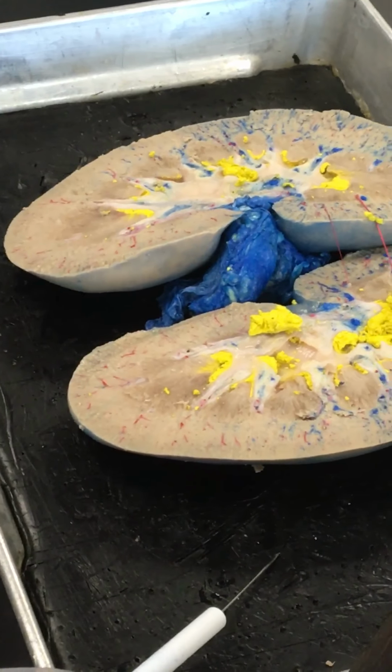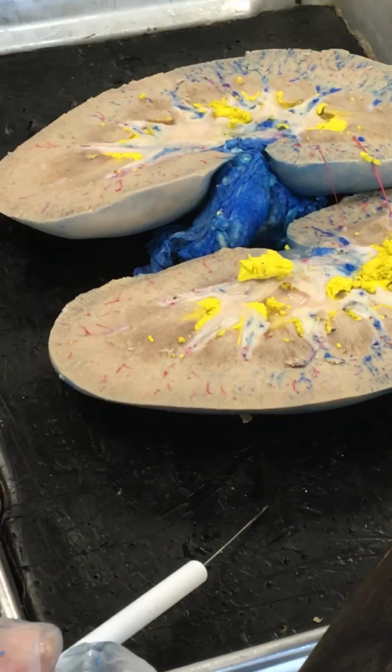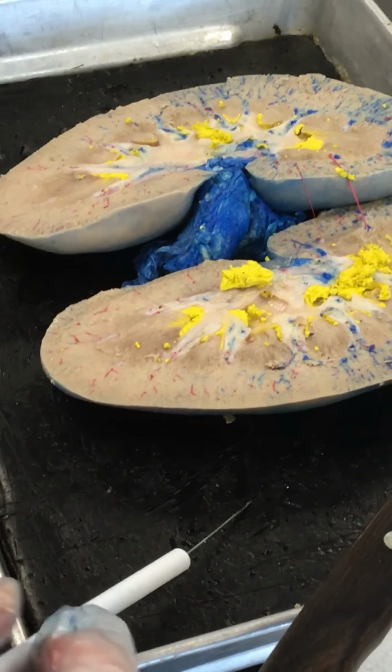Cortex, medulla, pyramids, papilla, columns, blood vessels, pelvis, hilus, calyces, and capsule. So I think we're there.